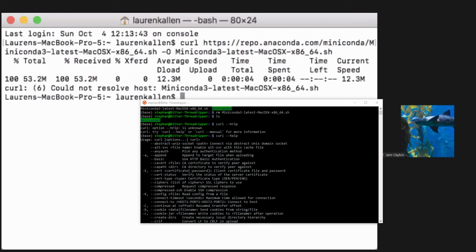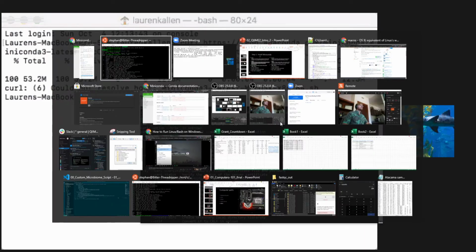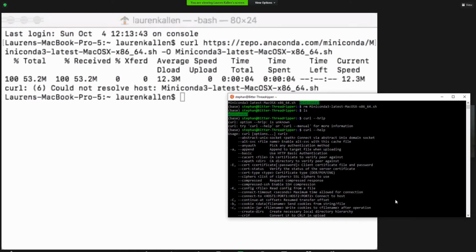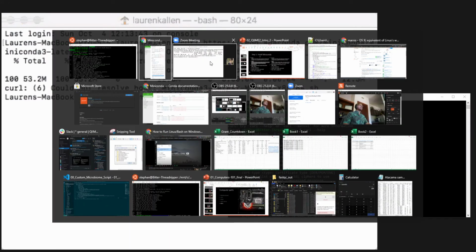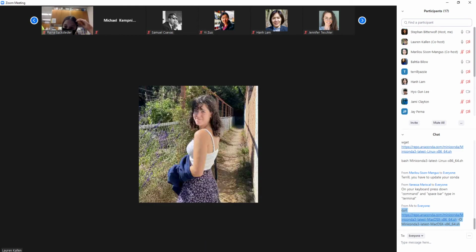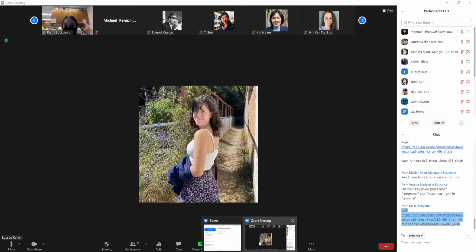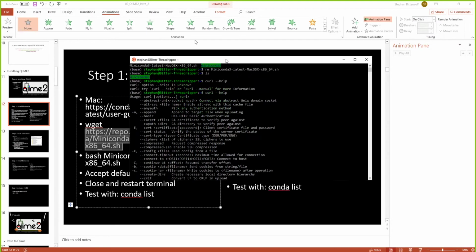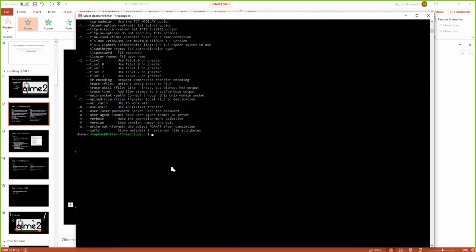We're going to go to the Mac. I'm going to see if it'll get it on my computer. Should I stop sharing? Yeah, you don't have to share anymore. Okay. I'll see if I can mimic it on my computer to show you, but you're essentially in the terminal now, so that's really good. Awesome. So here's my Linux thing, which is more or less running bash.